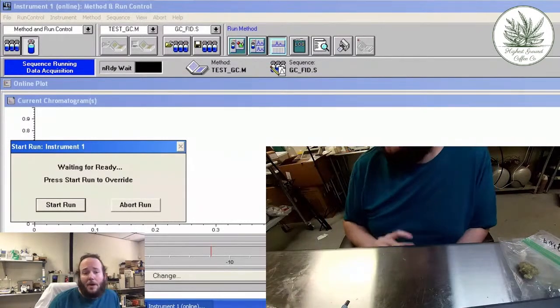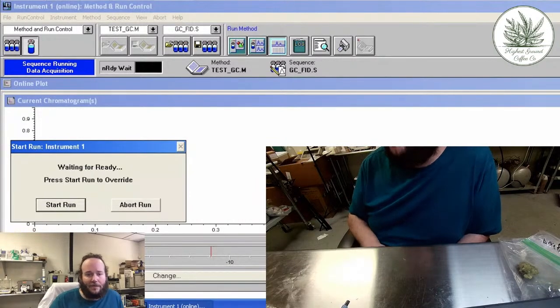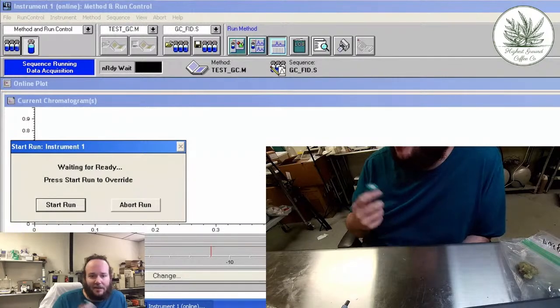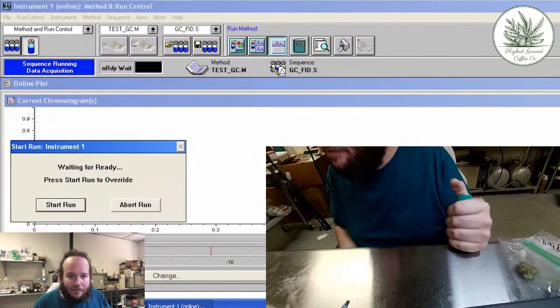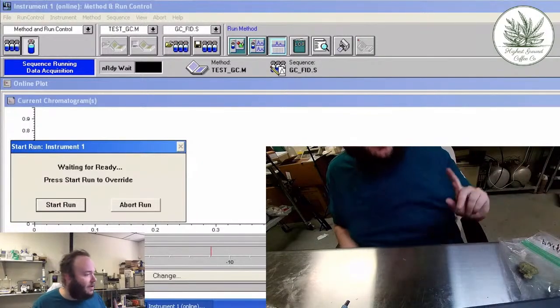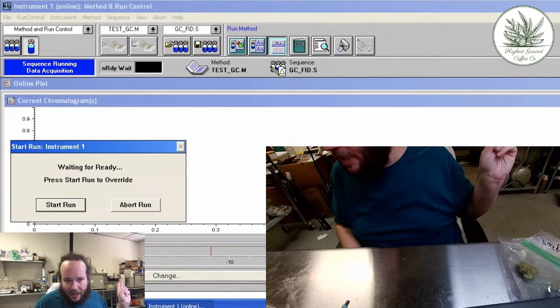But yeah, so you order the kit online, I ship it to you, you put a little sample in it, fill the form out, ship it back, and then once I get the test, usually within about 2 to 3 days, you'll get your results. It just depends. Now, I will tell you, a week or 2 weeks ago, the mail guy dropped off 2 samples next door and I didn't get those for like 2 weeks.